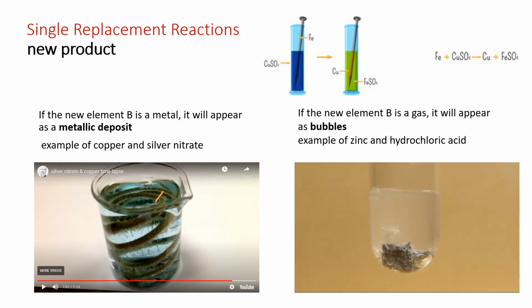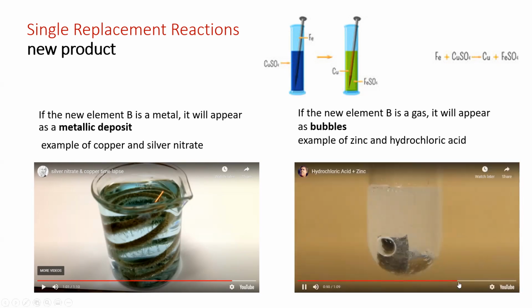But this hydrogen gas is something that you'll see in these reactions today, is that you can test this gas that's formed. And you're going to see this here in this video. The gas that's formed is odorless, it's colorless. And basically, if you put a little cap on the top of this test tube, you're going to collect the gas in the test tube. And so let me speed this up. I think this is going to test this here.